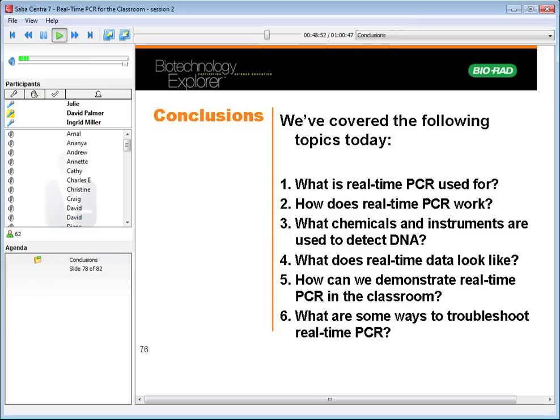So we've looked at these subjects today. What is real-time PCR used for? How does it work? What chemicals and instruments are used to detect DNA? What does the real-time data look like? How can we demonstrate it in the classroom? And what are some ways to troubleshoot real-time PCR?